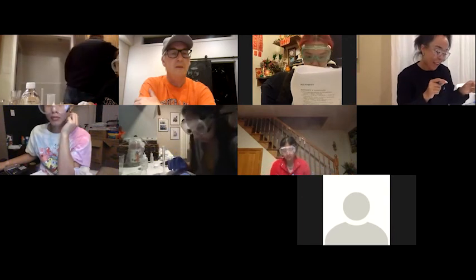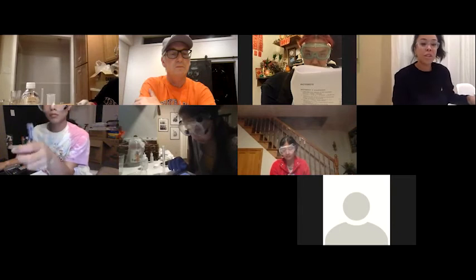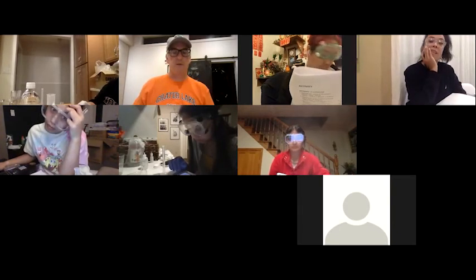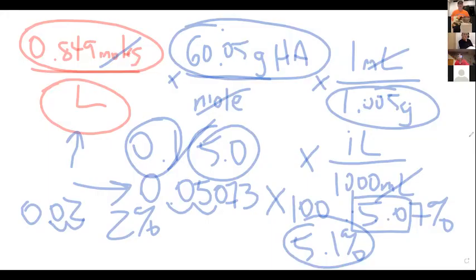In the last equation that you wrote, I'm trying to follow. I can put that back up, I think. Hopefully it's still there. Yep, still there. So 1.005 grams, where does that come from? That's the density.